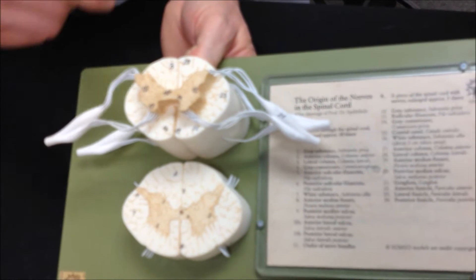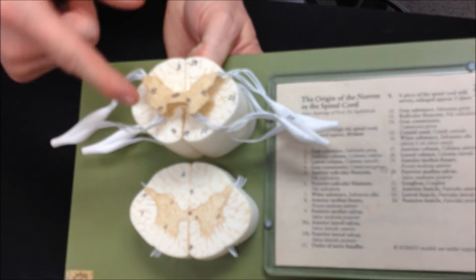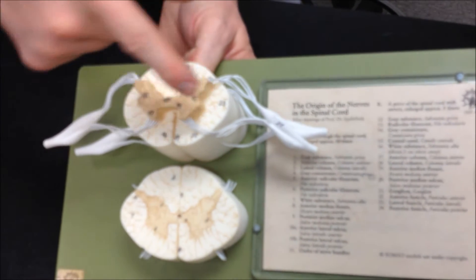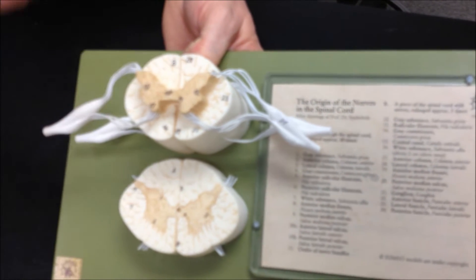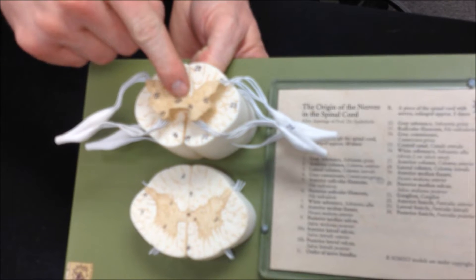So if we look at the gray matter here, the posterior horns, and the lateral horns, the bumps on the side, and the anterior horns. And the communicating part is the gray commissure. And the little spot in the middle is the central canal.